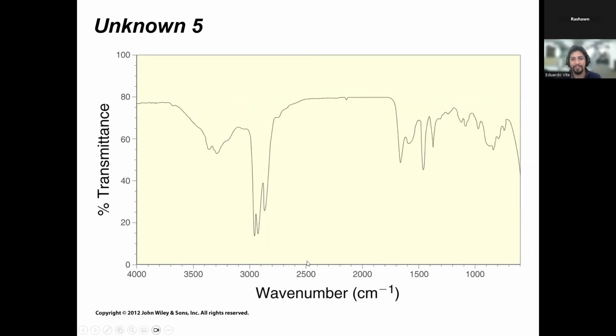What about this one here? What do we see here? Yep, yep, exactly. Primary amine. There you go. See, you guys are getting better now. You don't see squiggles anymore. Now you're starting to know where to look, right?